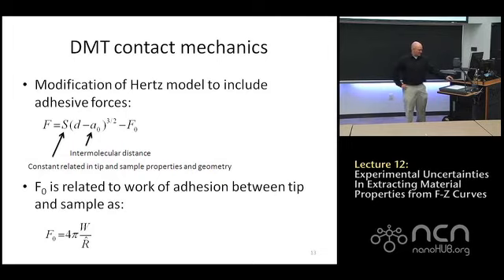So in theory, using the Dupre equation, you can calculate the interfacial energy between a crystal and a model. W equals the three interfacial energies added, first two added, last one subtracted. So you'd have to know two of the three interfacial energies to calculate the third, which is an issue. There's an approximation which says if only dispersive forces are present, the work of adhesion is equal to the square root of the product of the two surface energies.